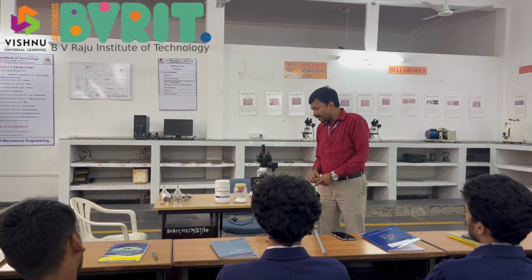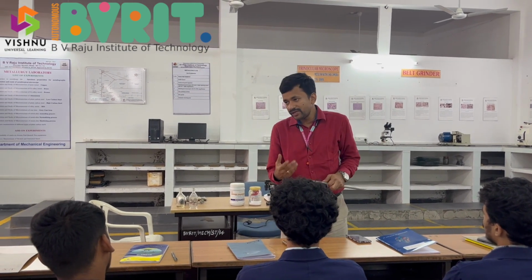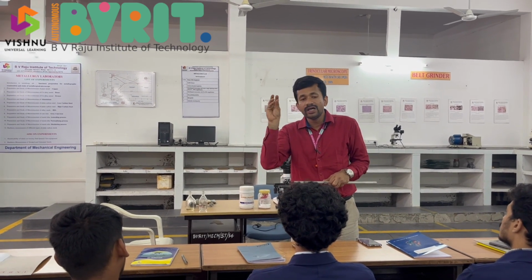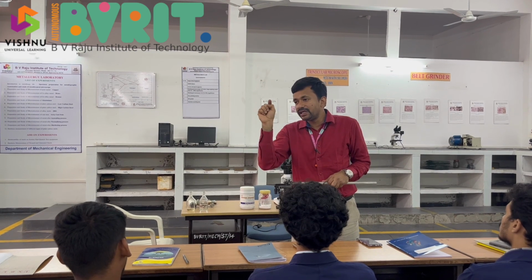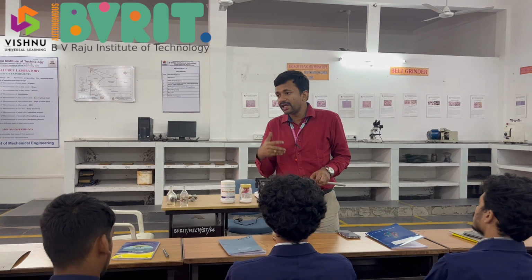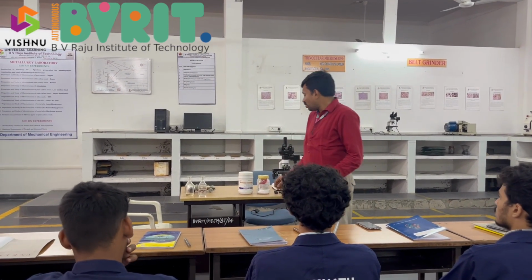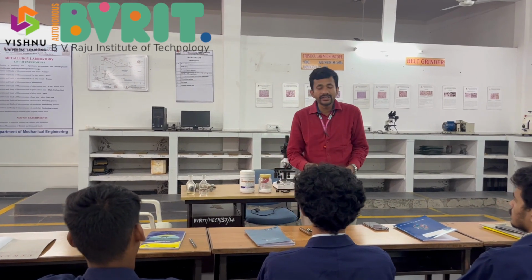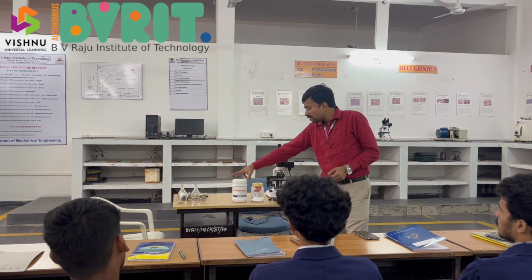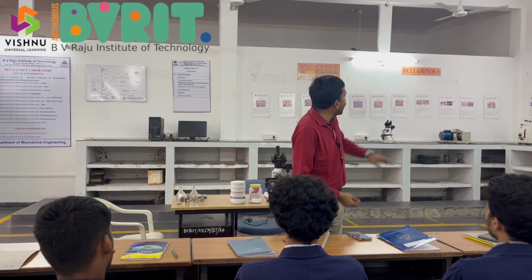So for that purpose, whenever we have a metal that we need to examine, we make that into a small part. Okay, so we cut it out, and then that metal piece we will make into a specimen. In order to convert it into a specimen, we have what is called bakelite powder, and we mount it in the bakelite powder using the hydraulic mounting press.